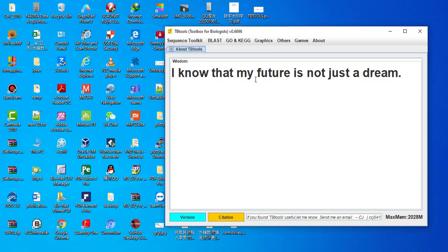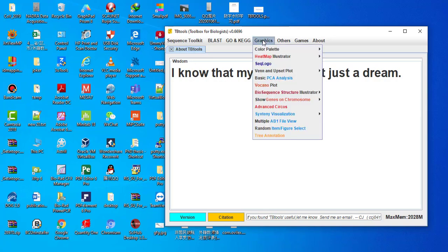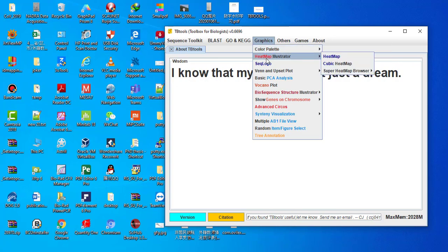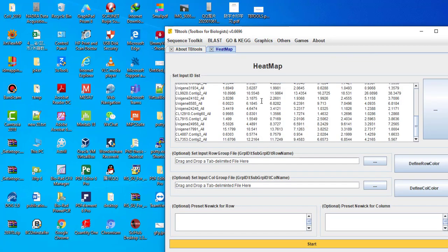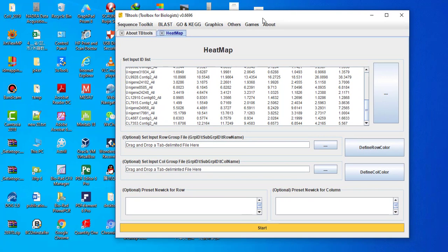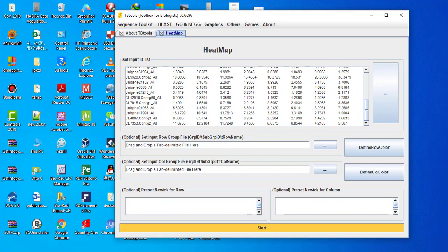First of all, open your TBTool software. Go to Graphics, then choose Heatmap Illustrator, then choose Heatmap, and you will get a window like this.